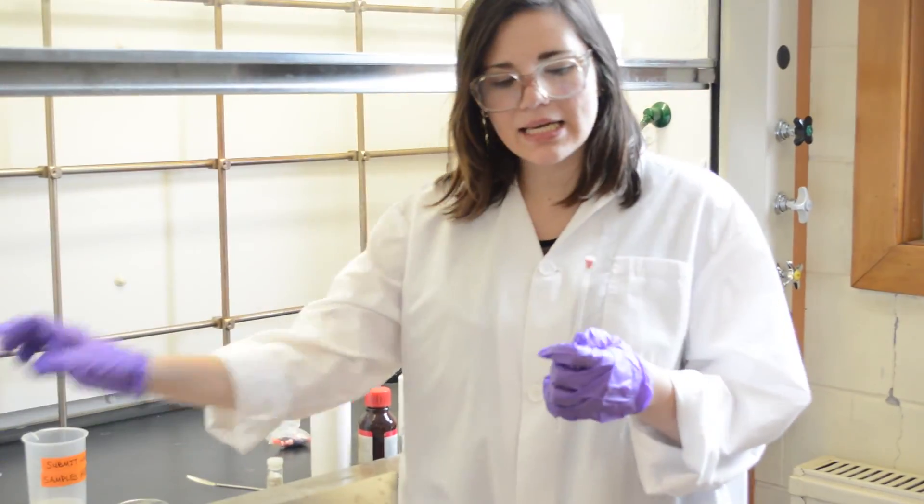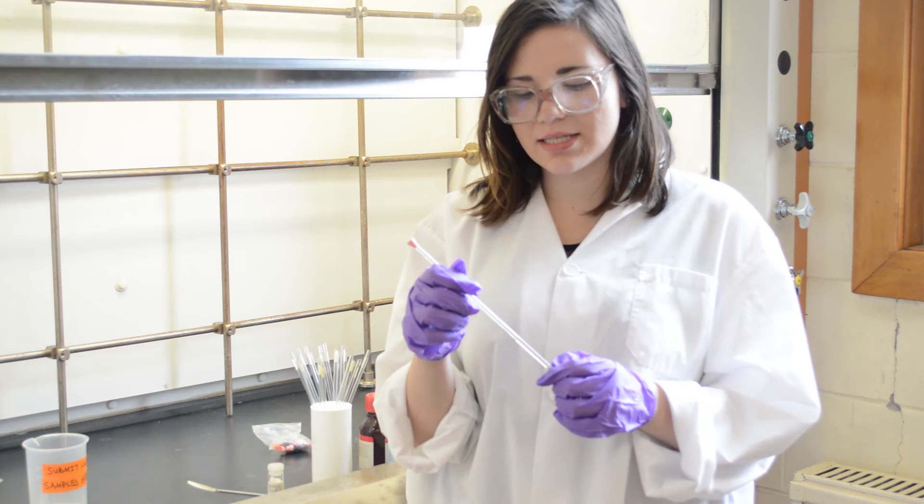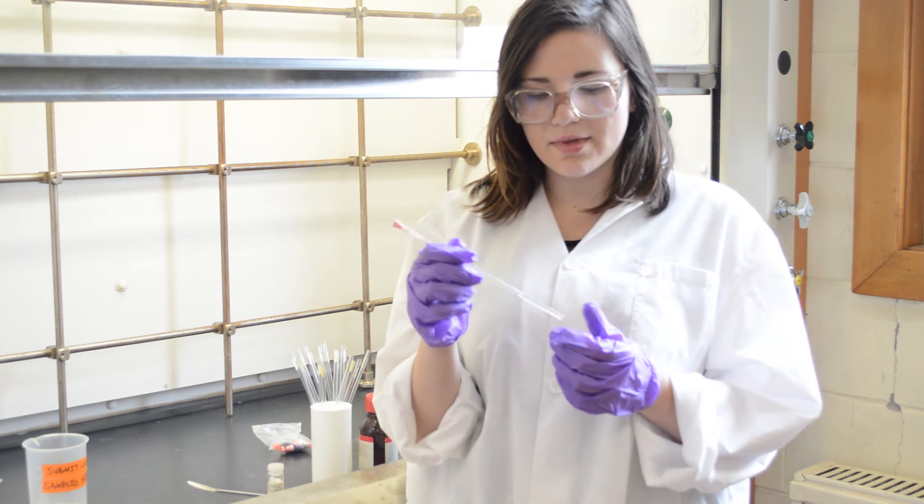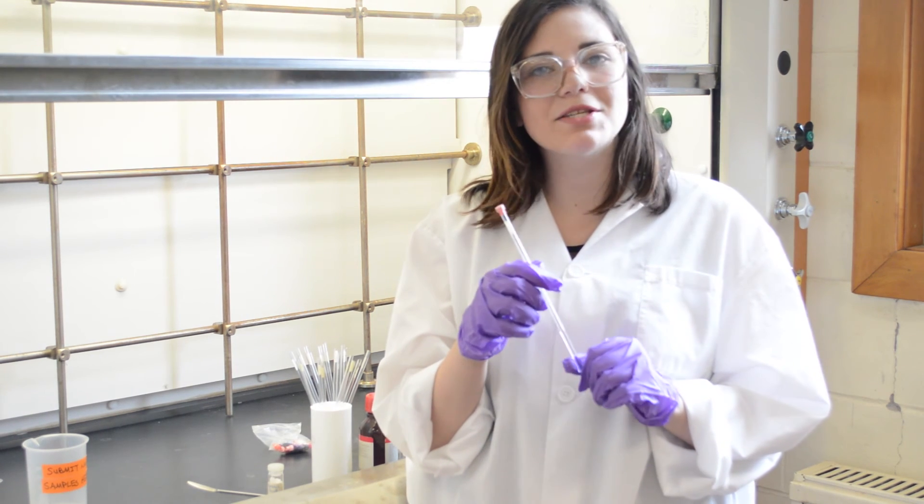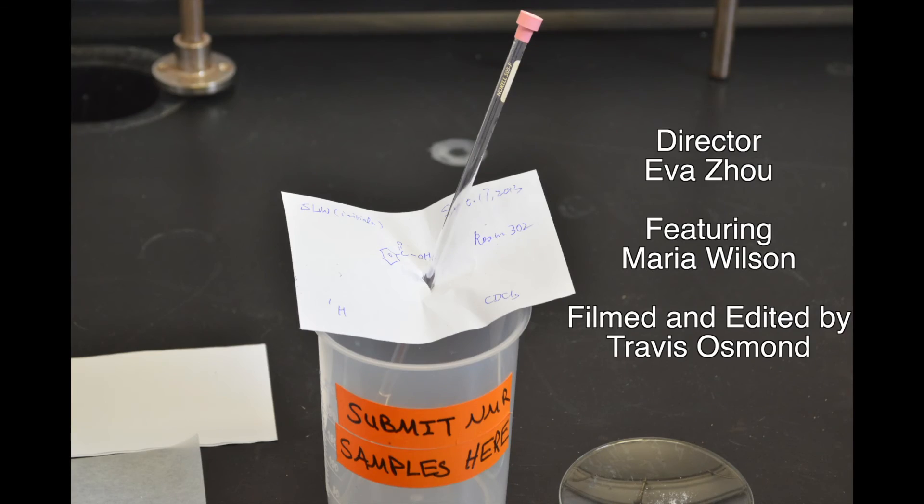To clean the NMR tubes, we usually just empty the solution out into the appropriate waste bottle, and then clean them out with some acetone in the drying oven. Thank you.